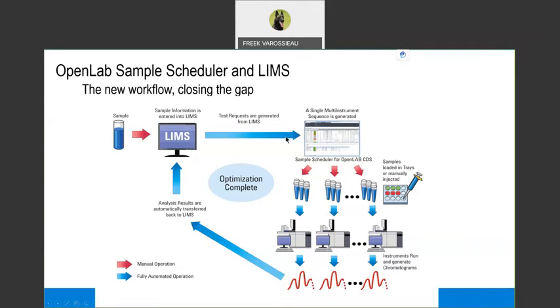So this entire workflow is now simplified in steps that are automated processes. And what we see here is that the manual results entry is gone. It's automatically either being reviewed or not. And the manual work still is the sample prep and putting the samples into the instruments.